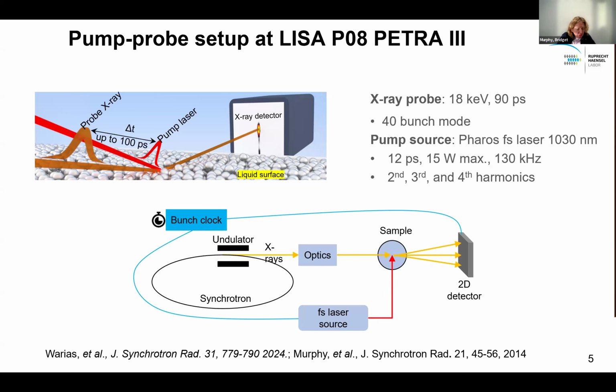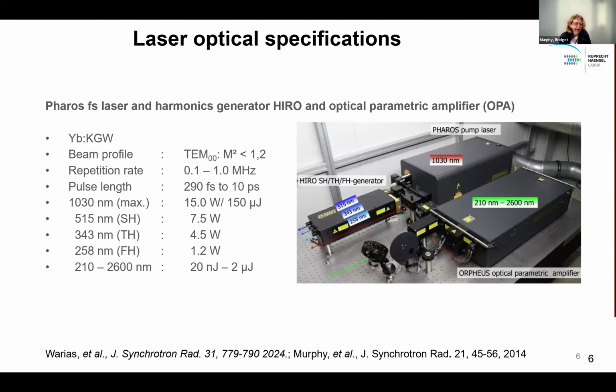And we can set this up so that it's running synchronized with the synchrotron here at Petra, so that we have nanosecond sensitivity. So the laser itself is quite a beast. We chose something that was stable and not the most exciting laser in the world, but it has enough power that we have.